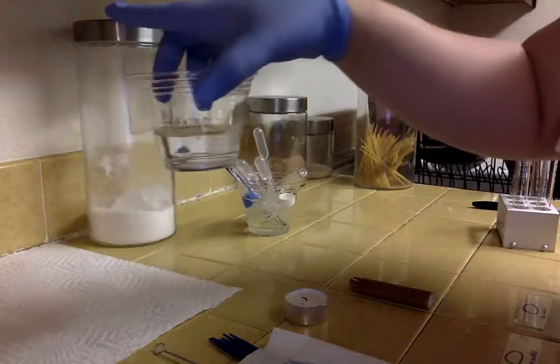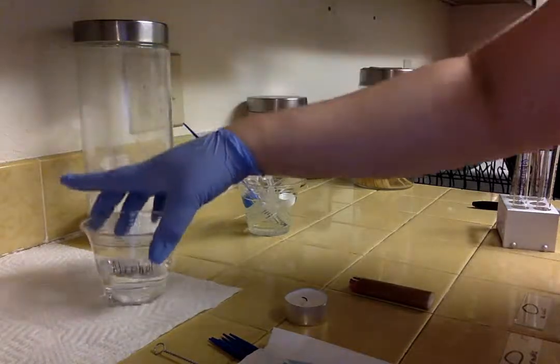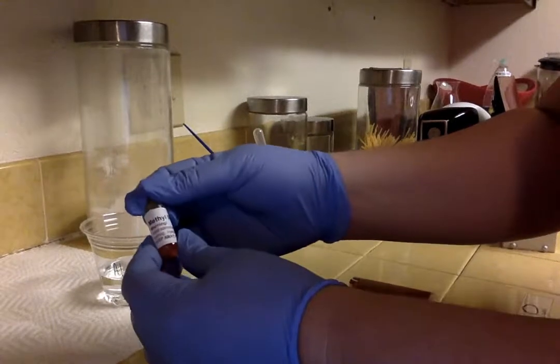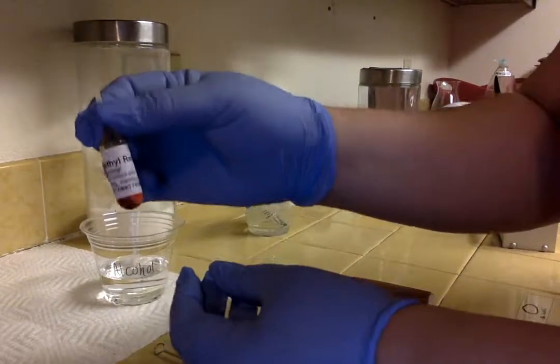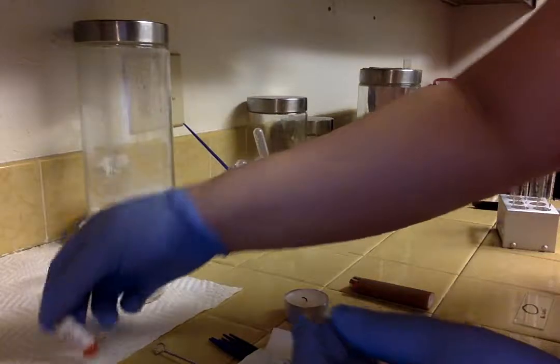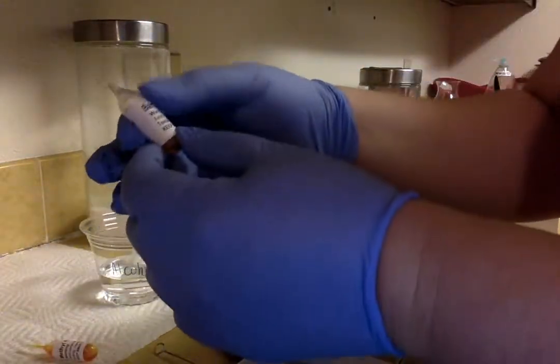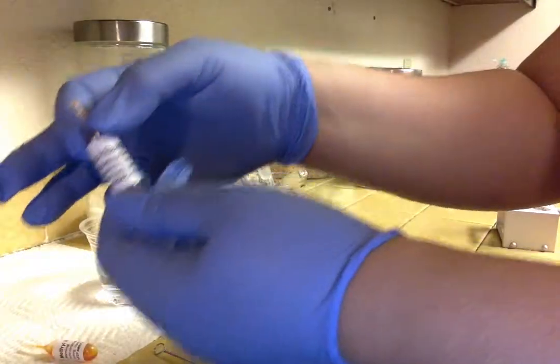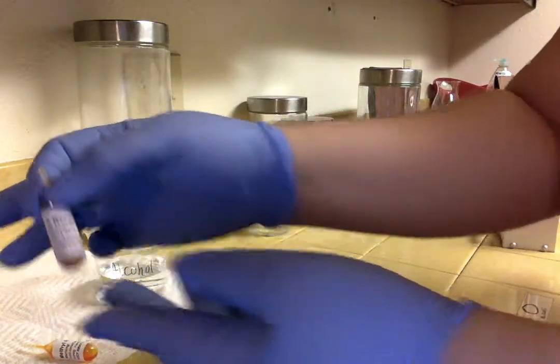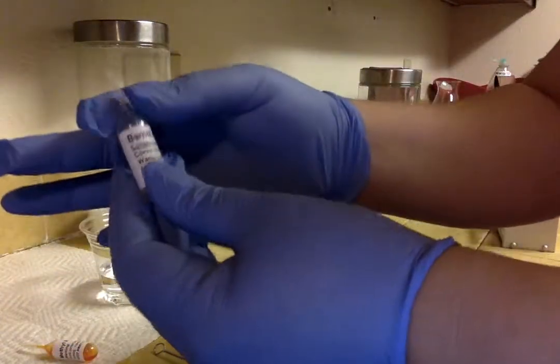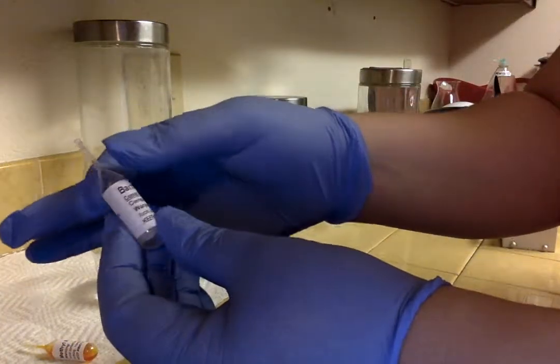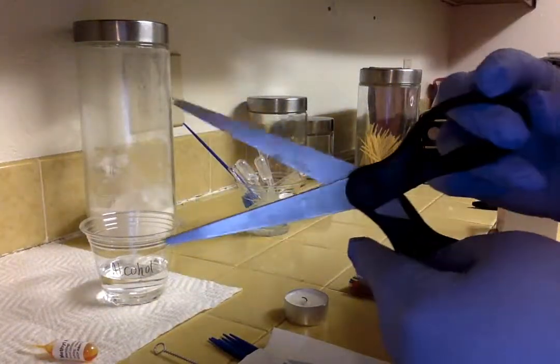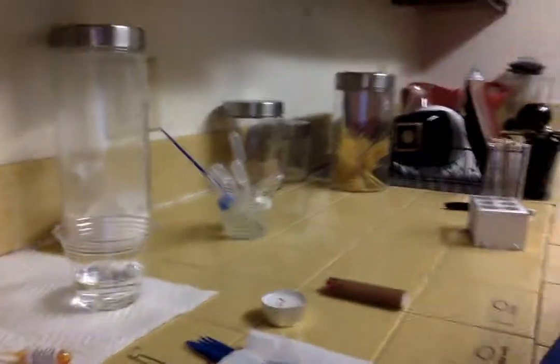I have my alcohol here. And then I have the dye that I used today, the methyl red. So that was for the first experiment. Reagent A was for the second one, and Reagent B was also for the second one. My scissors and my clean workspace.